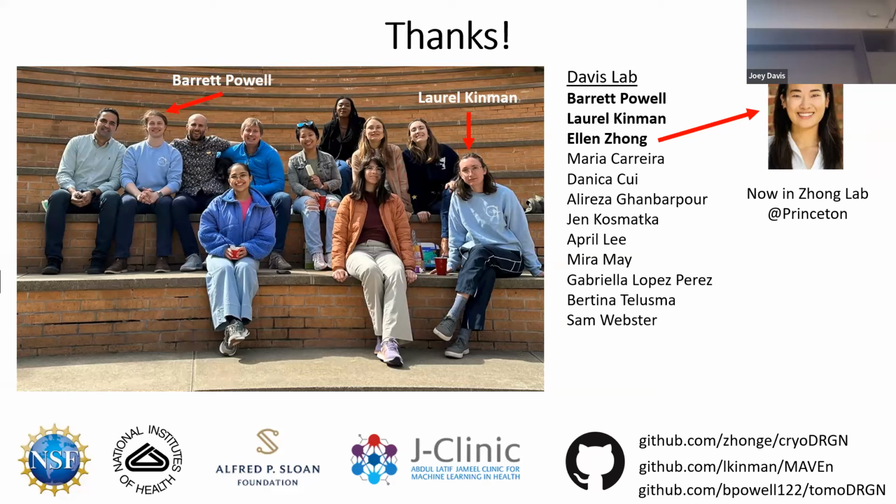So you have single base pair resolution. And so you can biochemically purify, say, a dozen different complexes, each with an additional base pair, and image all dozen of those separately. You now have ground truth, you know all of them are the +1, +2, +3, and so on. And then you can take those particle stacks and mix them in whatever distributions you want, but you still have the labels associated with the images.